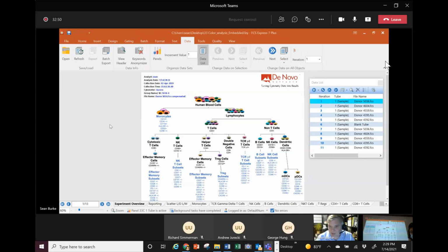Now, in this other experiment, this is what we call an immunophenotyping experiment, where we take, say, blood out of somebody's body, and we isolate all of the white blood cells from that tube of blood. Again, if you, heaven forbid, have to go get a cancer test or something like this, they might do that. They take blood from your body, they isolate all the white blood cells, and then they put markers on those cells for things that identify what's a T cell, like CD3, things that identify what's a helper T cell, like CD4, things that identify what's a natural killer T cell, things that identify what's a B cell, things that identify what's a dendritic cell, right?